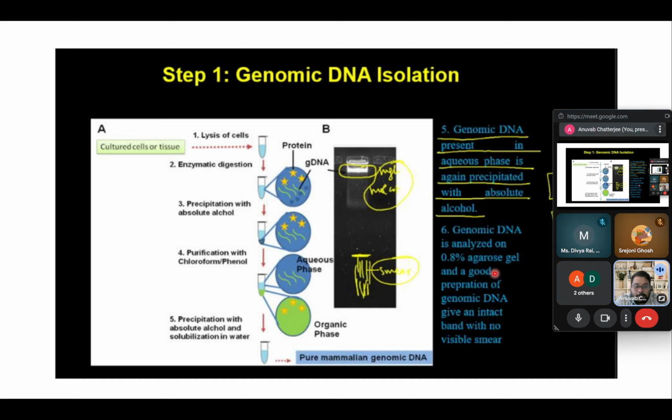You will learn what that is in a bit. And in the agarose gel, essentially you run it and it looks something like this. So this is the image of an agarose gel. You load the DNA in something known as a well. So essentially a cavity in which you can load the DNA, and you apply an electric field to both ends, negative on this end, positive on this end, and DNA will obviously try to move to the positive end, and depending on the weight of the DNA, it will either move a lot or not at all.